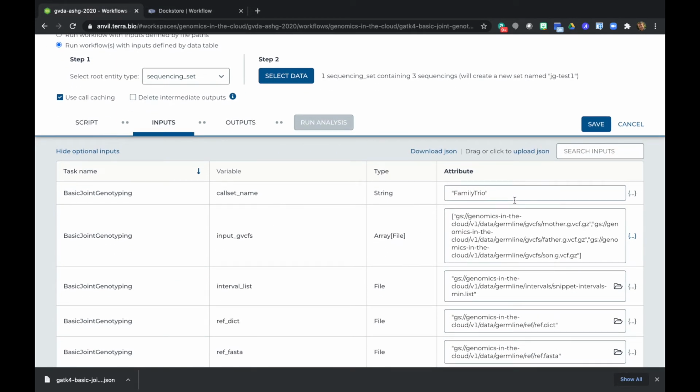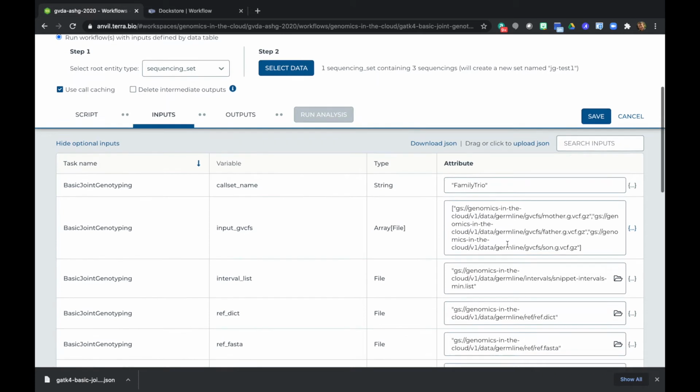Look at the fields in the Inputs tab. We need to replace all these direct file paths that are left over from the original configuration with references to the data from the imported datasets, a list of intervals, and the appropriate genome resources. I'm going to start with the genome reference resources because it's probably the less challenging piece, and it will allow us to ease into a couple of new concepts that can take a little getting used to.